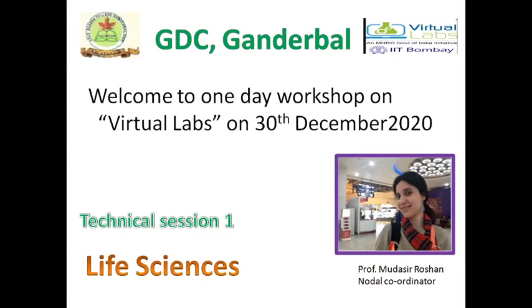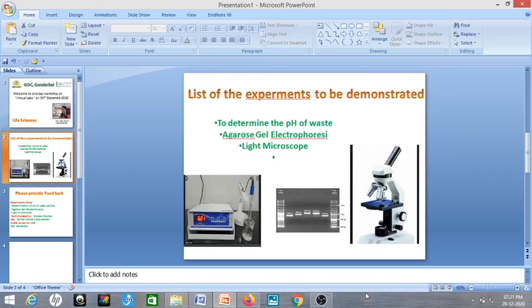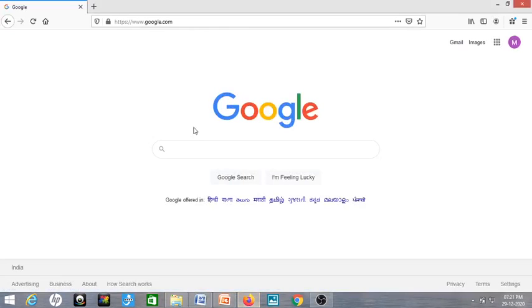And the first session will be conducted by me, Mudassir Roshan, Nodal Coordinator, and the technical session will be on life sciences. The list of the practicals which will be demonstrated: number first, to determine pH of the wastewater; number second will be gel electrophoresis; and number third will be on light microscope. So let's begin the experiments on the portal of IIT Bombay.